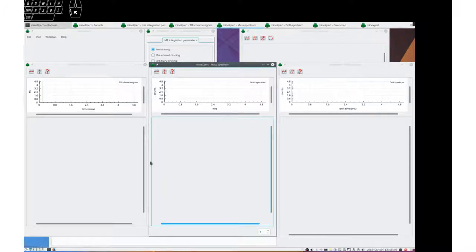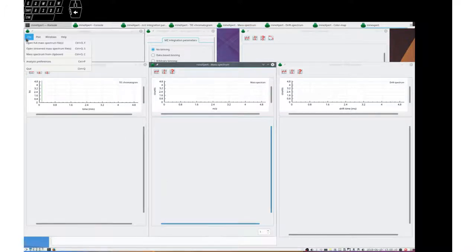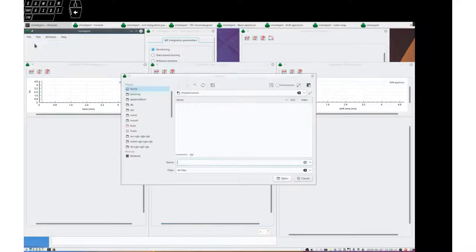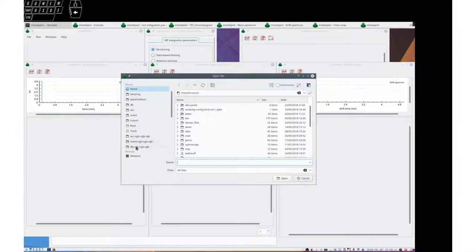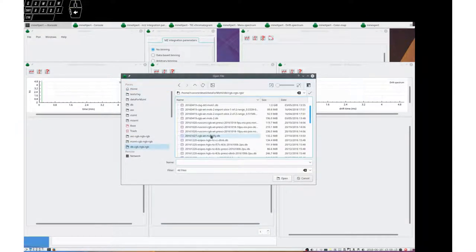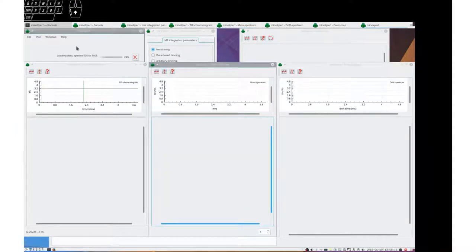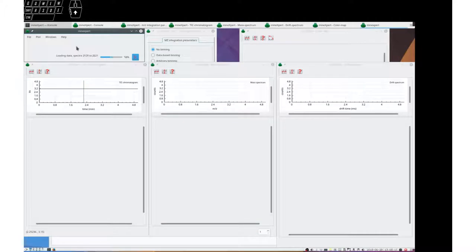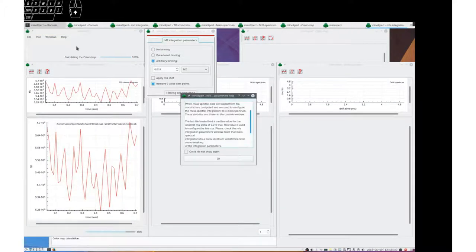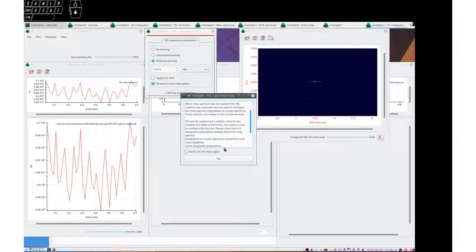Let's open a file. I will open an ion mobility mass spectrometry data file so that we can document the integrations also to a drift spectrum.